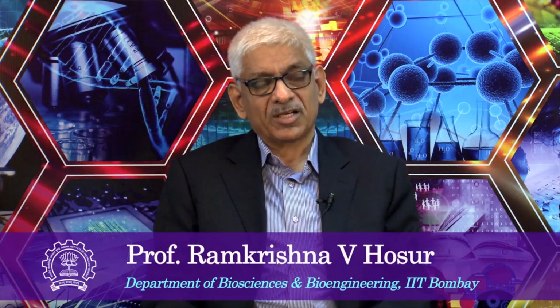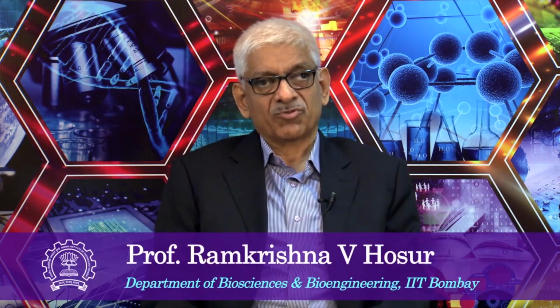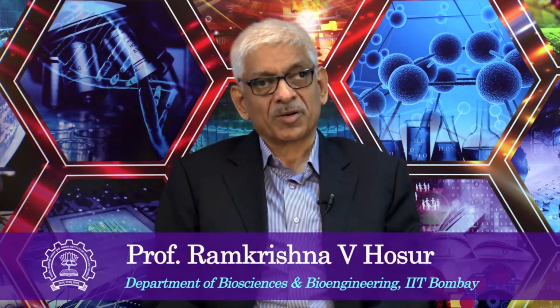We have been discussing two-dimensional correlation experiments. The COSY experiment was the first experiment to be developed, and that was the most fundamental of all of these correlation experiments. Let us do a quick recap of what we did in the last class.